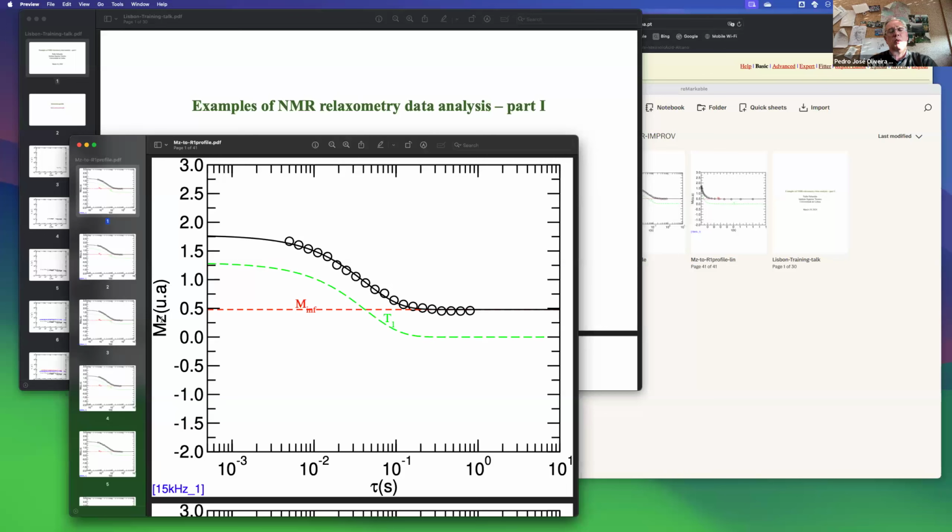So usually we choose our frame of reference in such a way that our z-axis is parallel to the magnetic field. So this Mz that I hope you are able to see my cursor moving. Actually, let me try to do a different thing. Just one second.